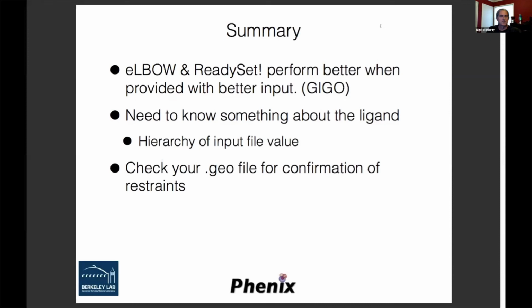The thing is that means you have to know a little bit more about your ligand, and you have to have some idea of how to validate it and have reasonable expectations.